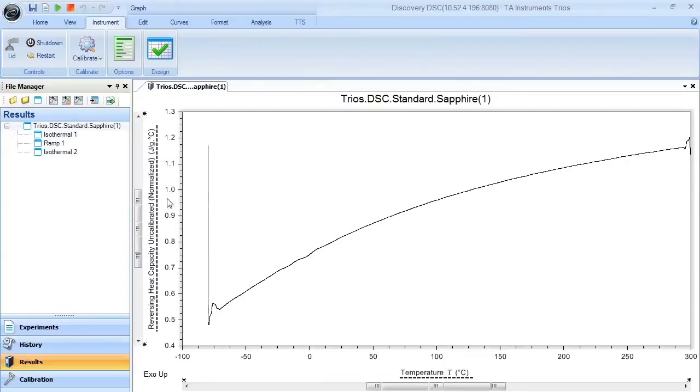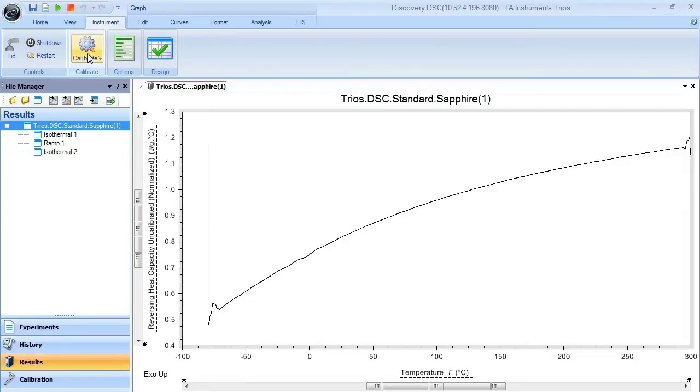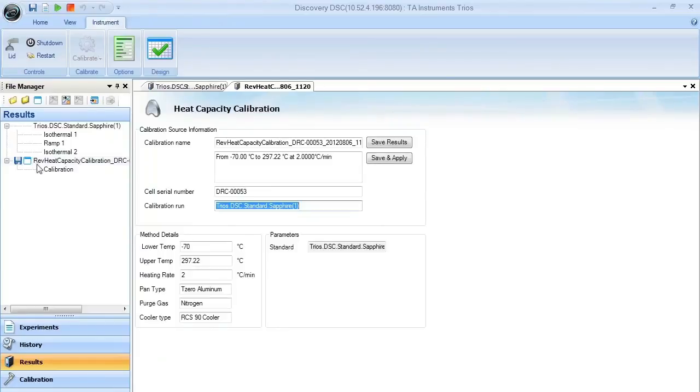Once we open the results manually, we see our data set here. If we select that item, the calibrate button will become active and the heat capacity item will become active. Once we select that, the analysis is actually done automatically.